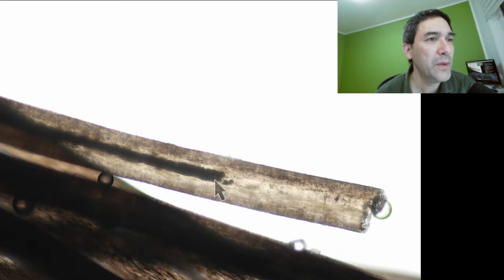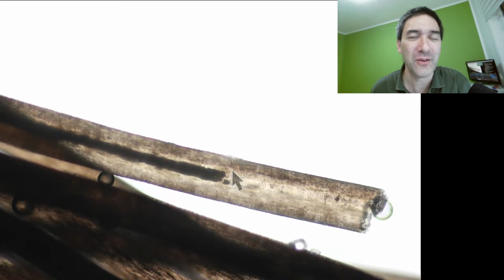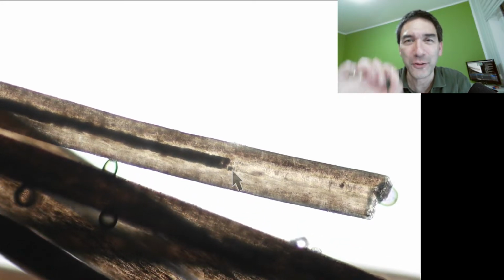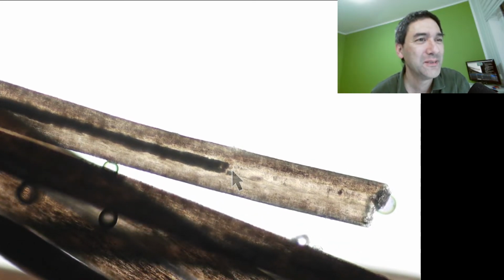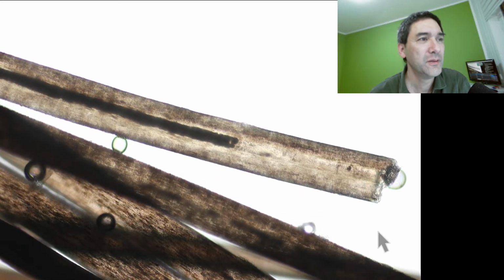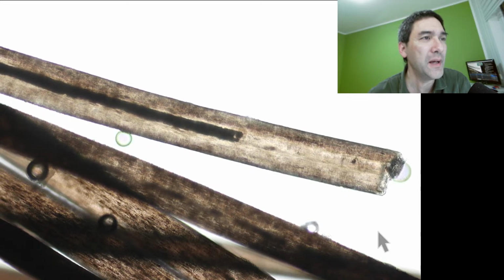When you shave yourself and put that under the microscope, then you can actually see some of the shavings when they're on the side, and you can see the cross section of the hair as well. It's quite interesting because then you're able to see that the central part has a different color. That's another thing: if it is in contact with water, it will expand.